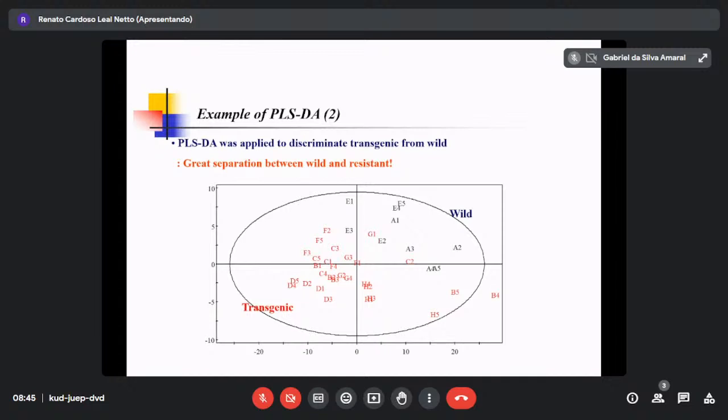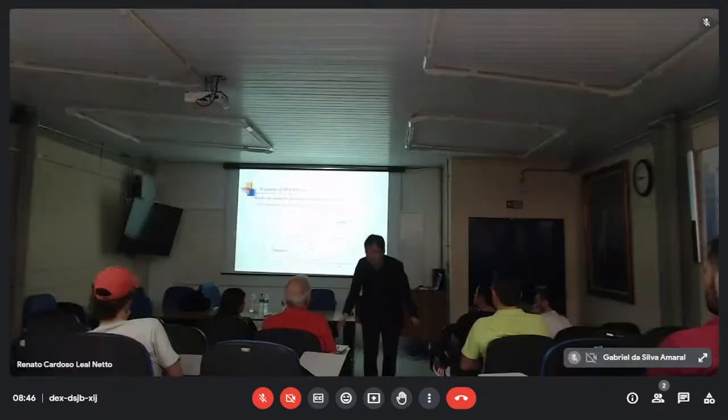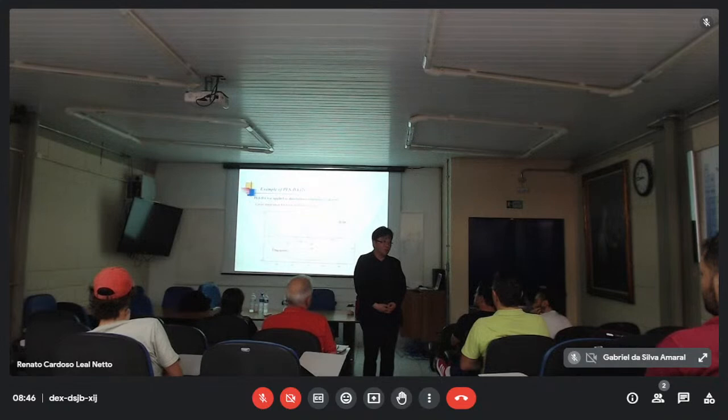So from this one, you have to be careful. One point: for principal component analysis, there is no rule. Now I want to show the separation. Then should I use principal component 1, principal component 2? Actually, no. Because you don't know, your wished separation can be in minor components. Sometimes principal component 20, sometimes 21. In that case, whatever you find in any principal component combination is possible. Do you understand?